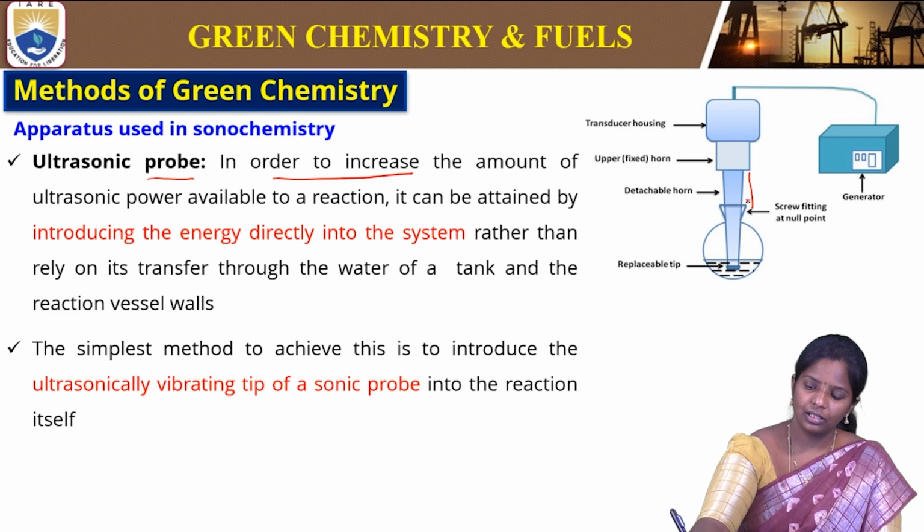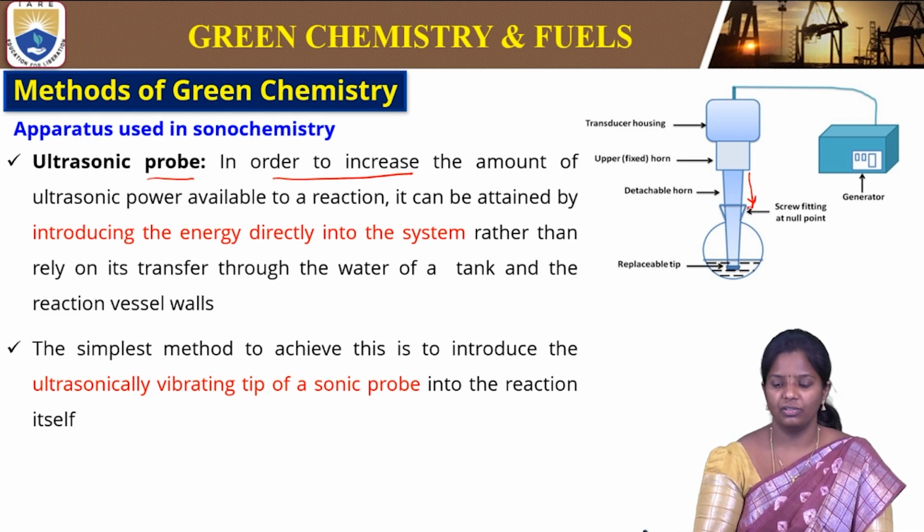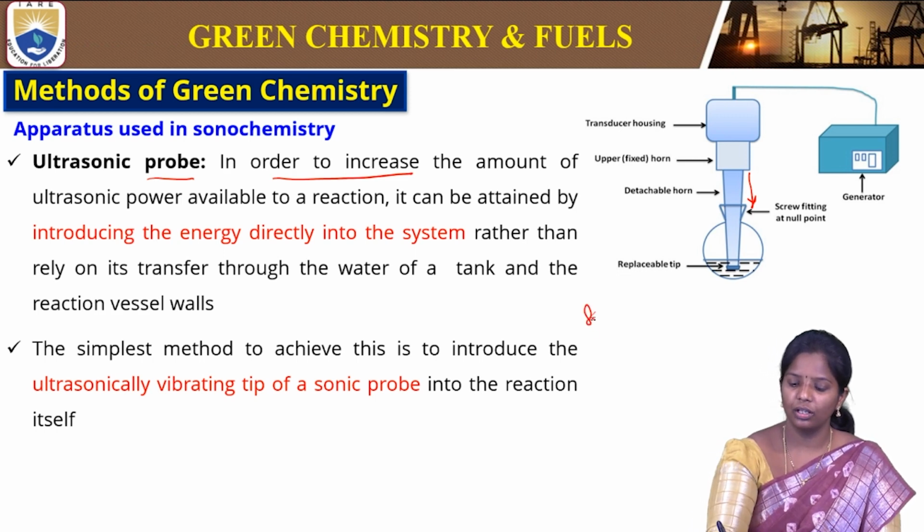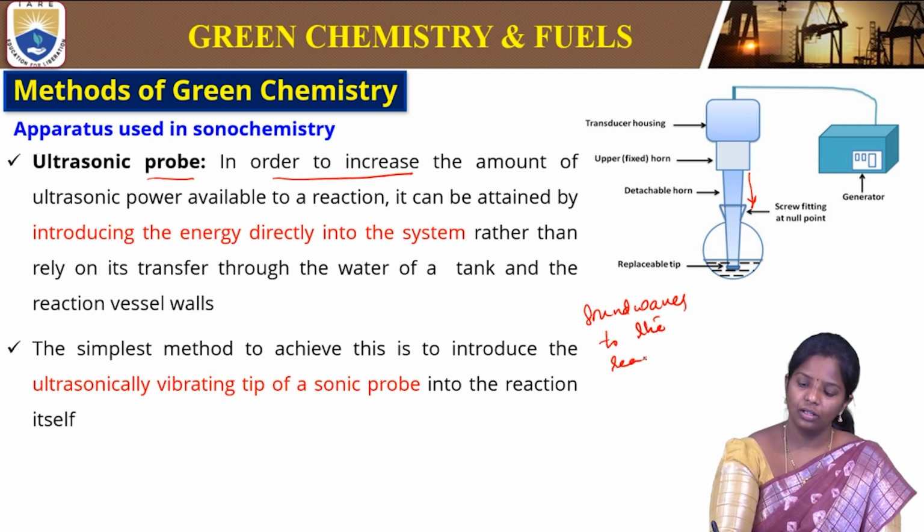Whenever we insert this probe into the reaction vessel, the vibration will increase. It means the ultrasound waves will increase, so there is no loss of these waves to any surroundings. It is directly giving the sound waves to the reactants. So the rate of reaction also may increase.